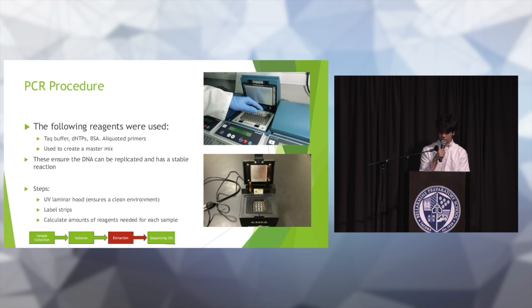Polymerase chain reaction, or PCR, is used to make copies of the DNA. For making copies, main components were added with the DNA gene to get a certain strand of the DNA. Primers were then taken from a freezer and used in a flow hood to ensure a sterile environment. Small tubes were labeled and given a corresponding amount of reagents and mixed to create a master mix. These were then placed into the thermocycler to facilitate the DNA amplification.